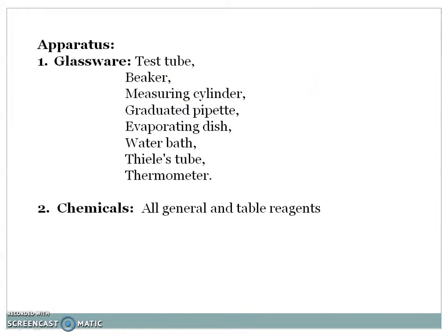Now we see the apparatus. Glassware: we require test tube, beaker, measuring cylinder, graduated pipette, evaporating dish, water bath, Thiele's tube and thermometer. And the chemicals: all general and table reagents. Now for the actual practical, move towards the laboratory.